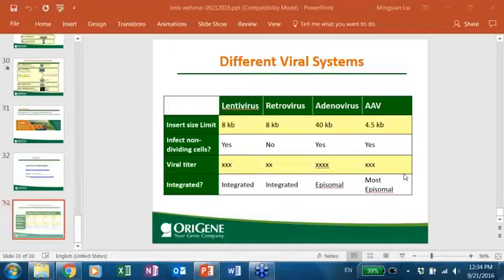Here's a very practical question: how do you store the viral soup after harvesting them? Yes. Because the virus is an enveloped virus, to avoid frequent freeze and thaws, you need to aliquot the viruses in smaller volumes, and then freeze them at -80.